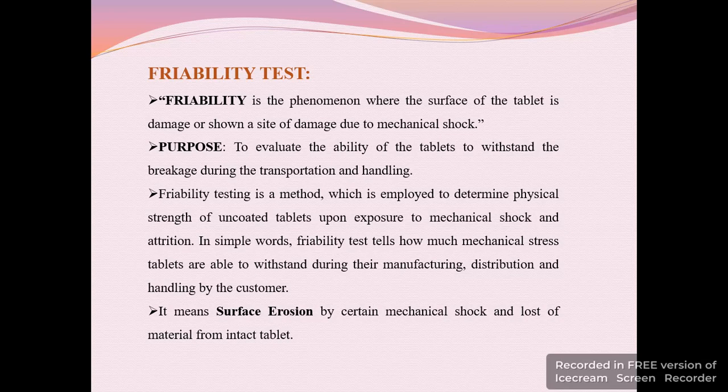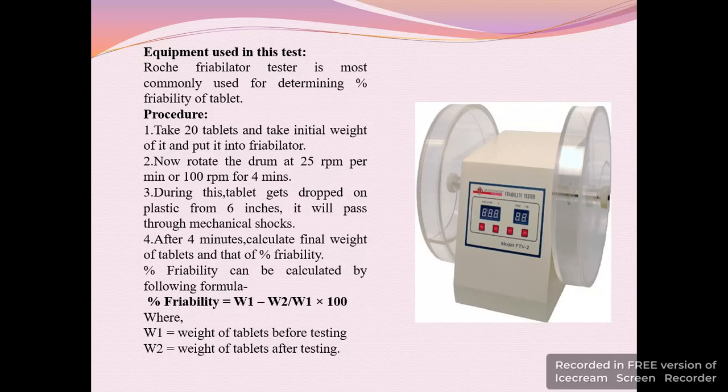So I'm going to discuss the basic procedure. What are the different equipments which are used in the friability test? So look at this one. This is called the Roche Friabilator. The Roche Friabilator tester is the most commonly used for determining the percentage friability of tablets. This equipment is used for the friability test, which is the physical test usually performed for tablets. That is called the Roche Friabilator.